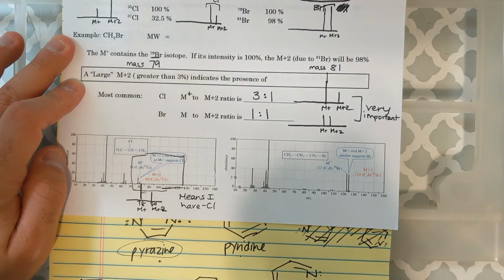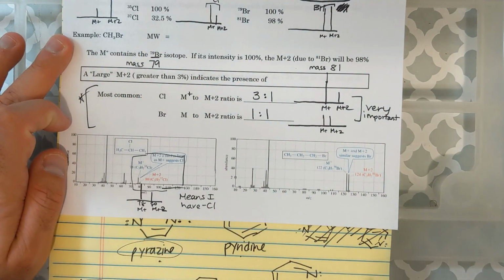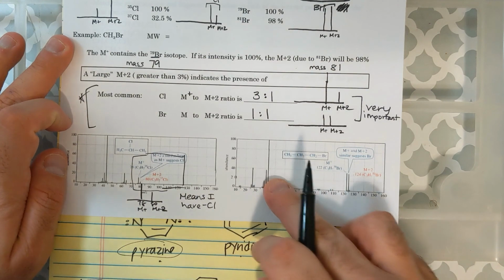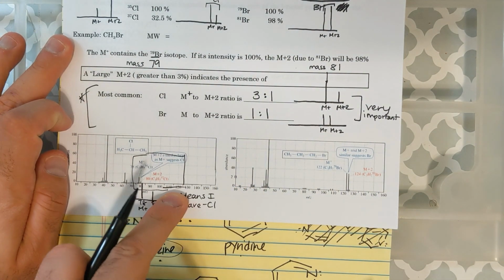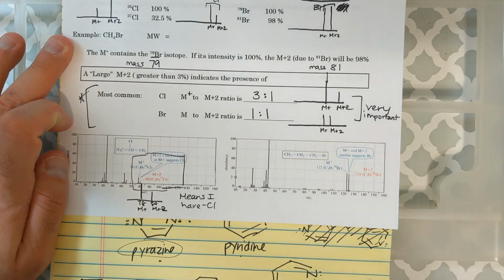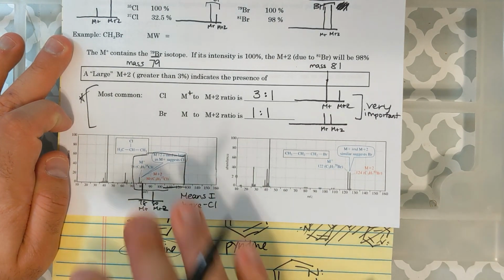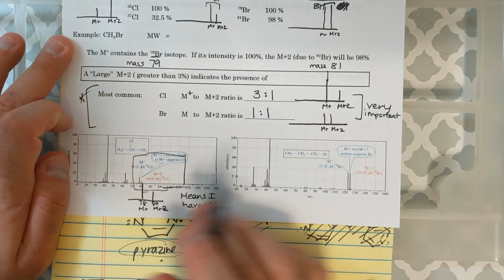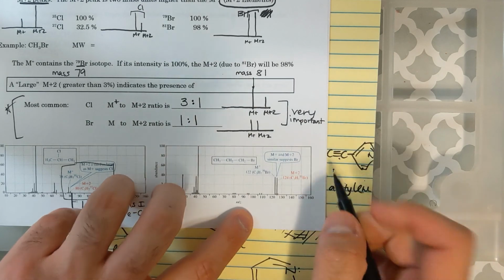So you'll see questions in the future, just put a star here. You'll see questions in the future that'll say what element is present. And if you see the M and M plus 2 peak, that means I have either bromine or chlorine. And if the M plus 2 peak is a third the height, that means I have chlorine. For bromine, look over here. Like I said over here, it's a 1-to-1 ratio.